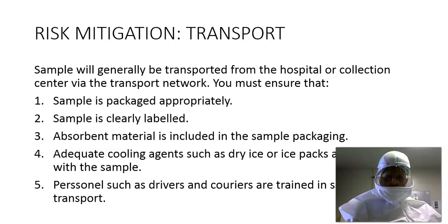You must ensure that the sample is packaged appropriately and clearly labeled. Absorbent material is included in the sample packaging to absorb any of the spills which may occur during transit. Adequate cooling agents such as dry ice or ice packs must be shipped with the sample in order to maintain its integrity. The usage of ice flakes is not recommended, as this may be prone to contamination.